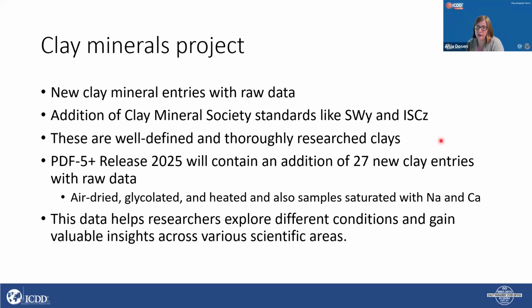They have been defined by the Clay Mineral Society and clay mineralogists, and having these diffraction patterns collected under different conditions is very, very useful. So we're going to have 27 new entries that pertain to these two in the next edition of our database. We're going to have, as I mentioned, air dried, glycolated, heated, and saturated samples.